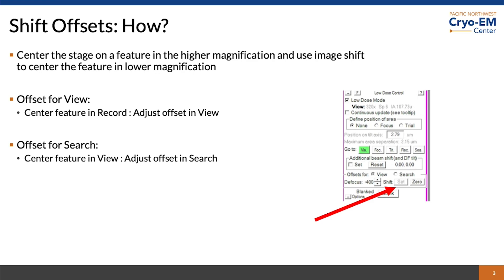So how do I do this? Well, first, center a feature with the stage. When I say that, use the joystick or just use stage movements. You're not using image shift. You want to be careful that it's a stage movement, therefore there isn't any image shift. You're imaging right down the optical axis, so the optical axis is in line with your feature.